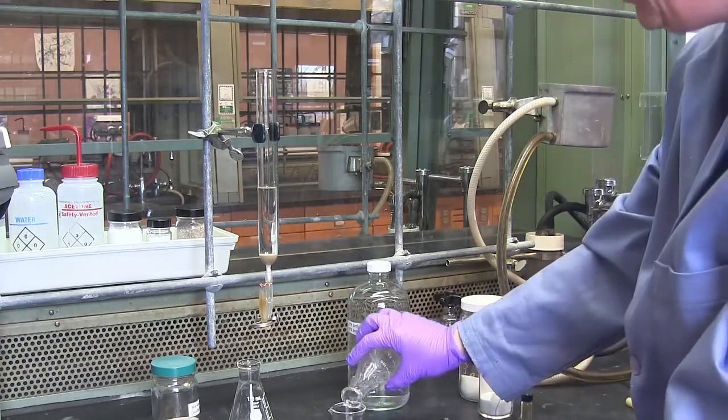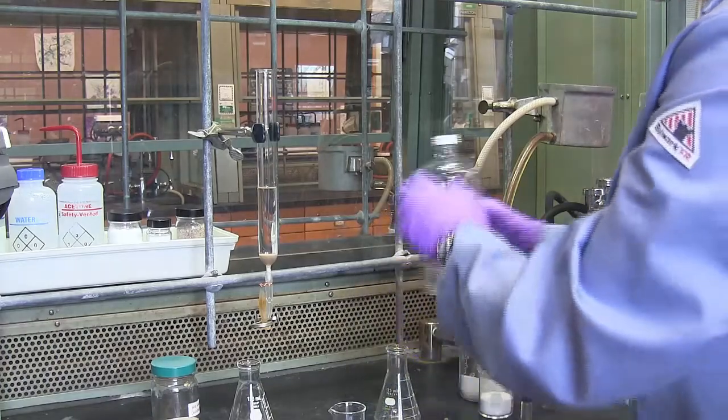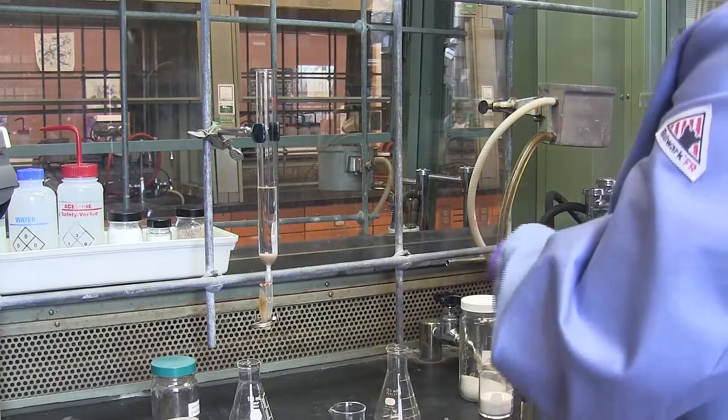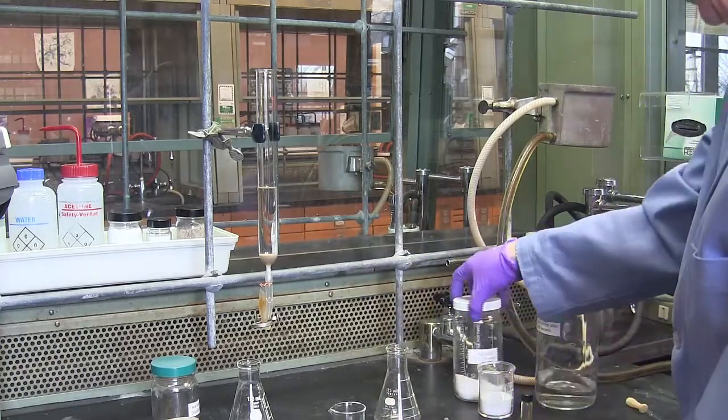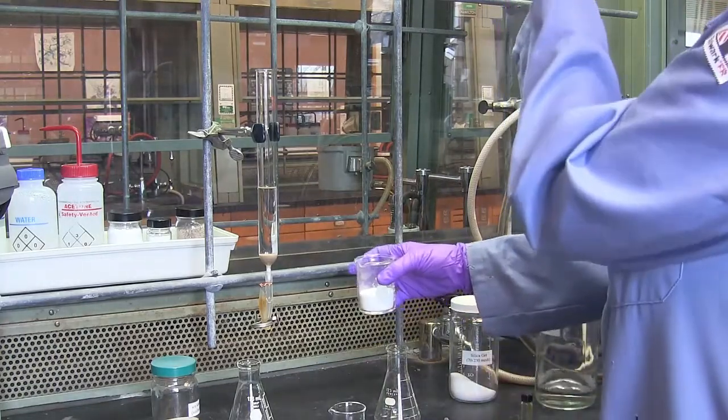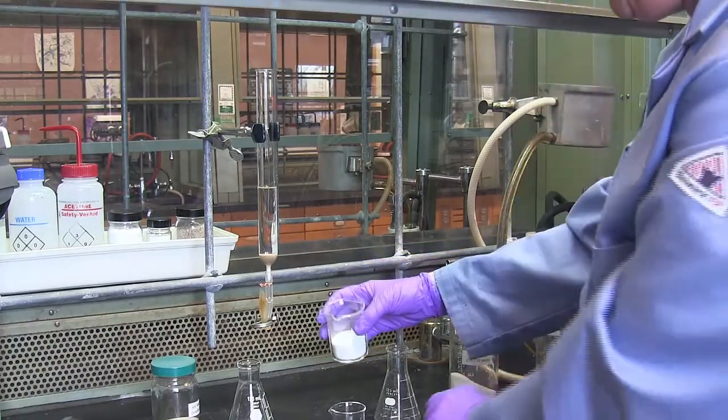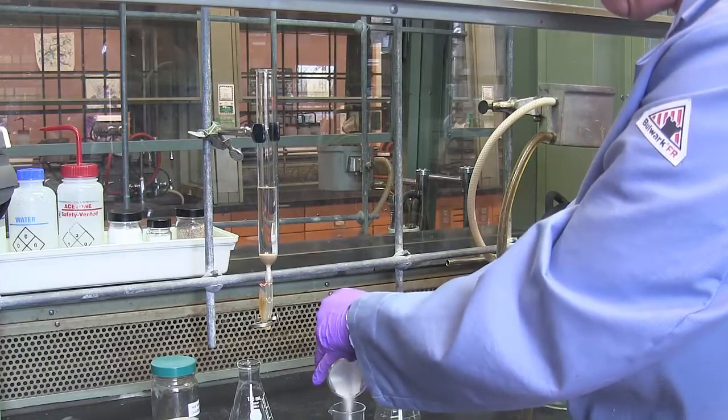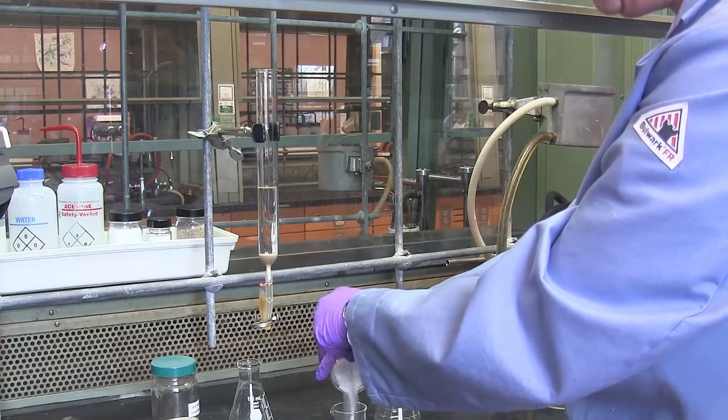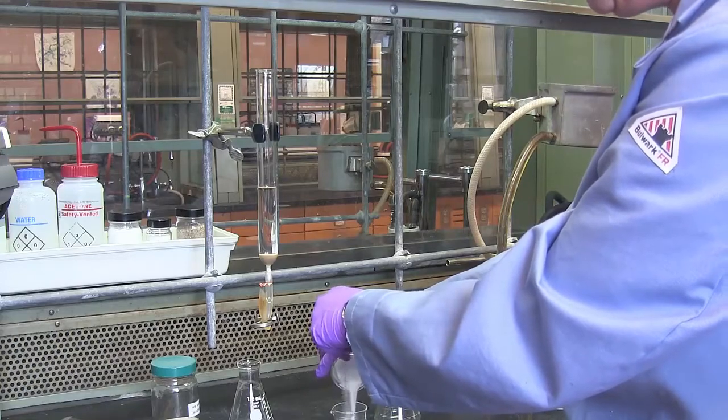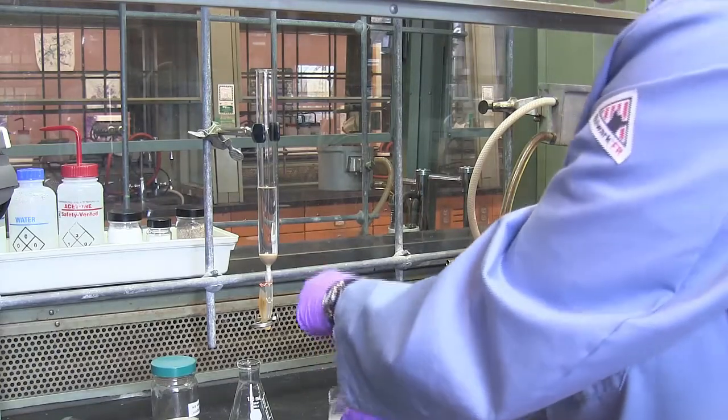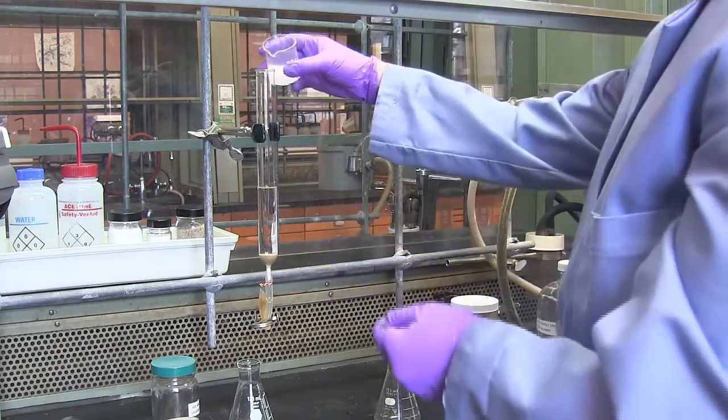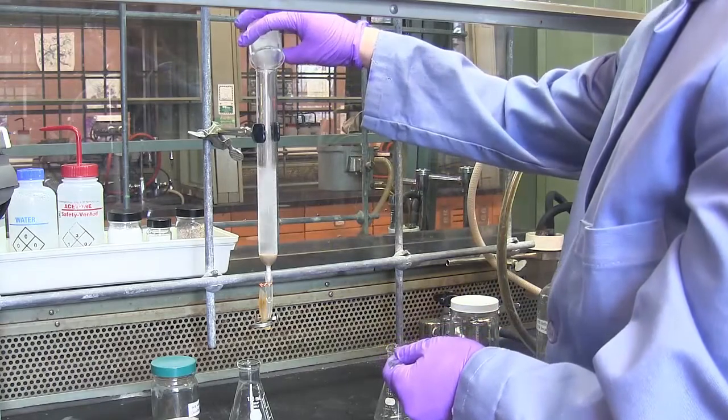To prepare a slurry, I add some of my eluent to a beaker, and then add some silica gel to the eluent. I still want the slurry that I'm making to have a flow to it so I can pour this into the glass column. When it starts getting kind of thick, I stop adding silica and begin to pour it in.